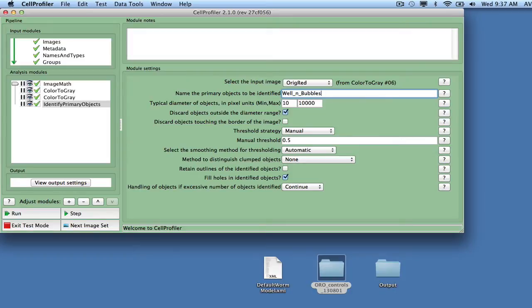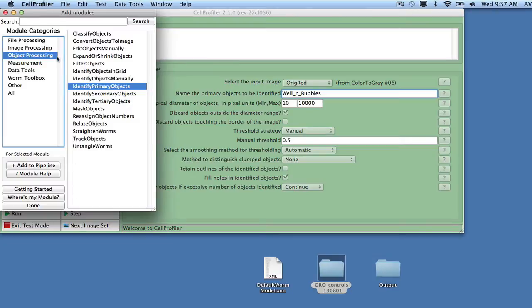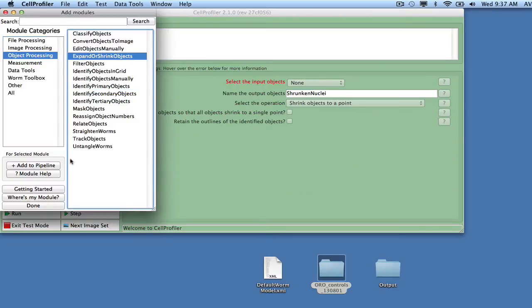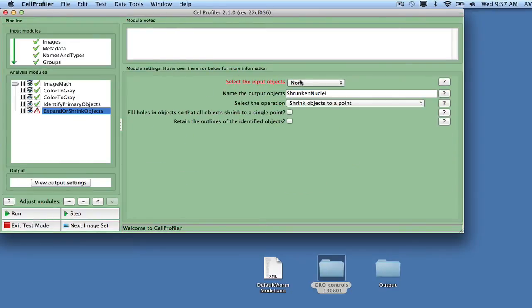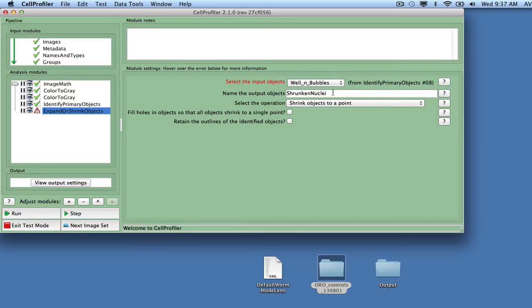We also want to remove shadows surrounding bubbles and well edges. To do this, we will add the module Expand or Shrink Objects, and select Expand Objects by a specified number of pixels, and expand the Well and Bubbles object by 5 pixels. We will call the output Expanded Well and Bubbles.